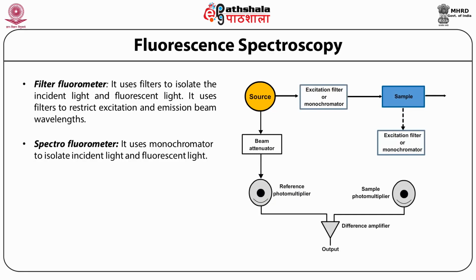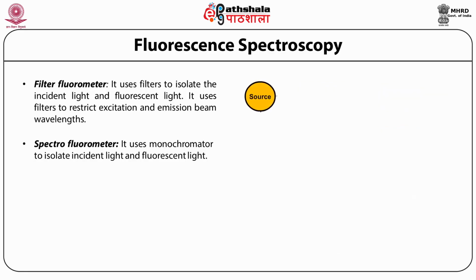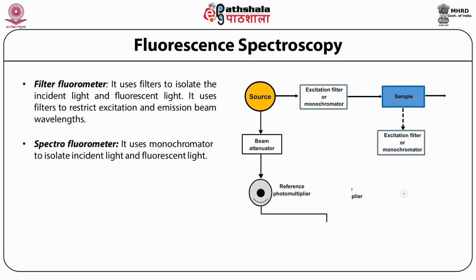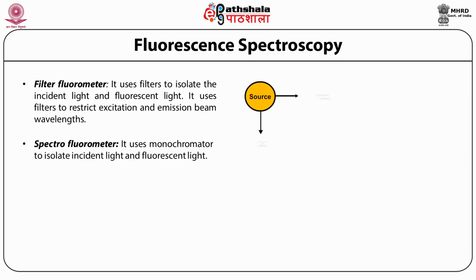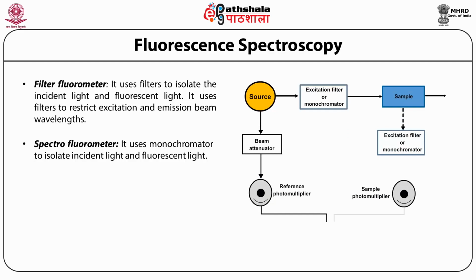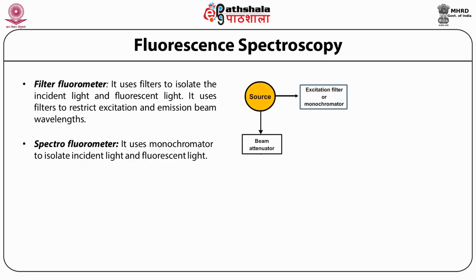The optical paths of the excitation and the detection light paths are along the orthogonal axis. The orthogonal arrangement ensures minimum leakage of excitation light into the detection site. High sensitivity photodetectors such as photomultipliers or charge coupled device cameras are commonly used.